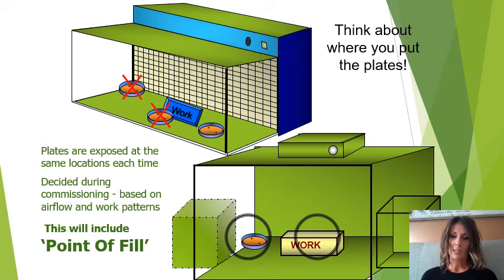So in the isolator cabinet here, this is the back left again. Not a great place, doesn't represent our working zone very well. It's out of the way, it's great for the operator as it's unlikely to ever be contaminated because it's not really representative of where we're working.